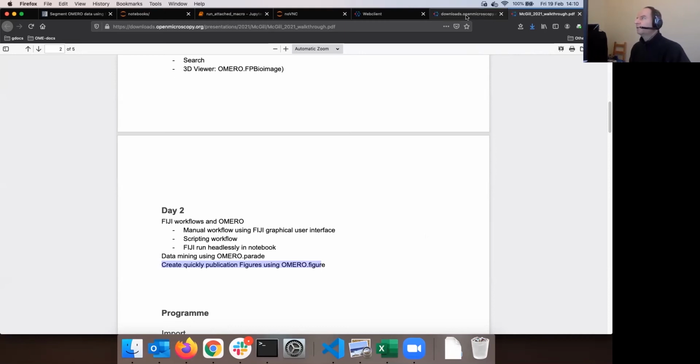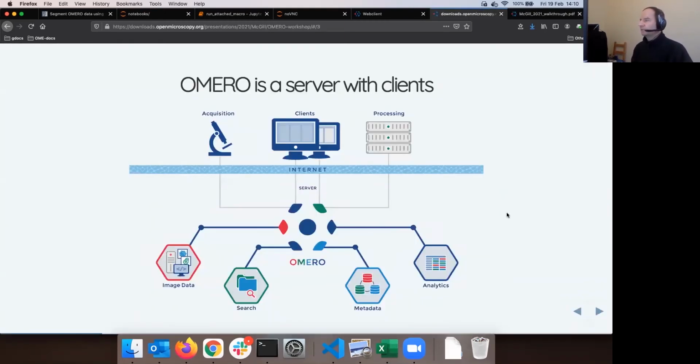Now, I will come back to the presentation yesterday. Don't worry, I will not go through that again. But what we want to make sure that we understand each other here about is how is the Omero ecosystem actually set up typically, and who is doing what? Where are the data? What are your responsibilities?